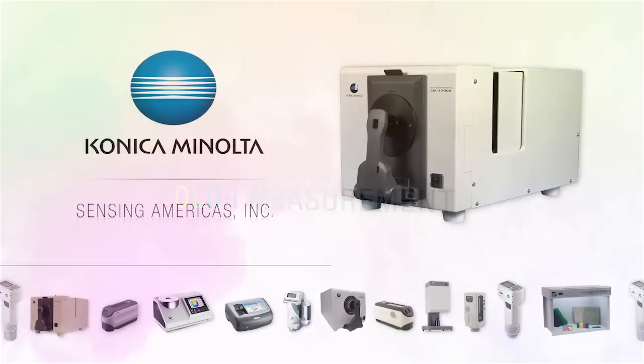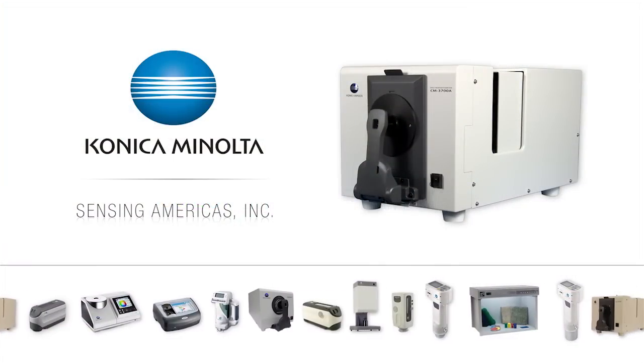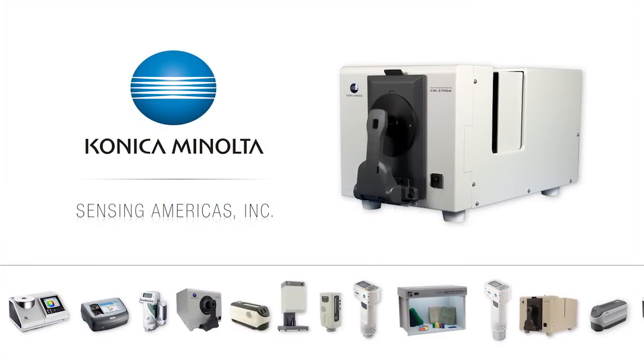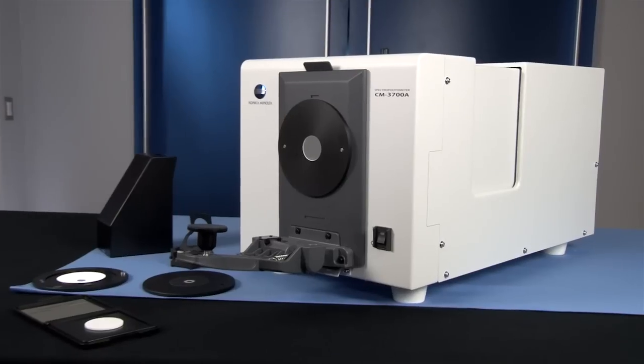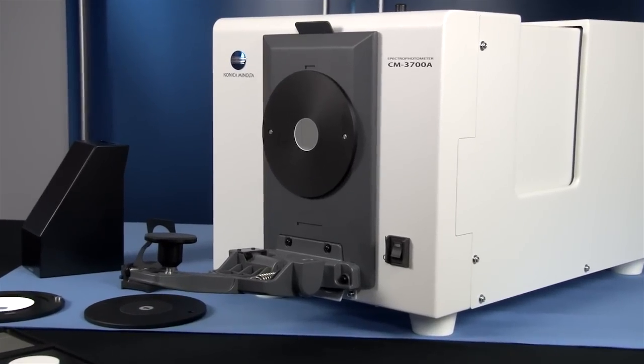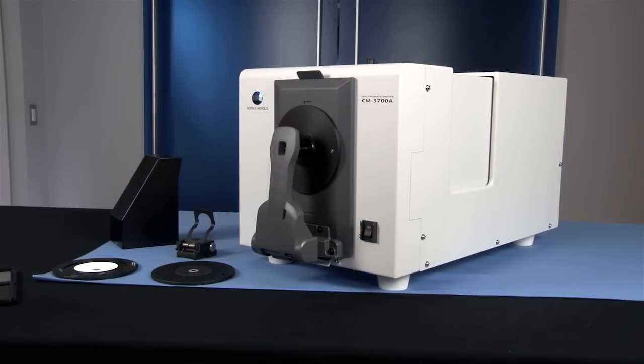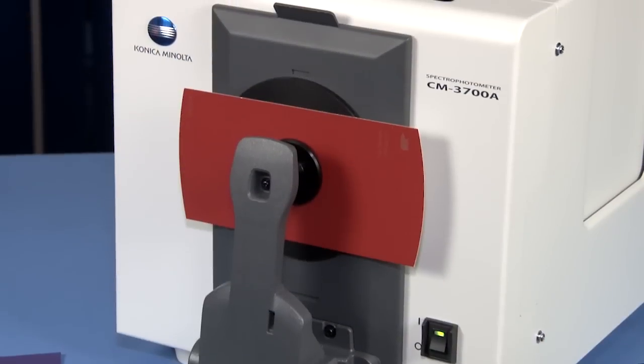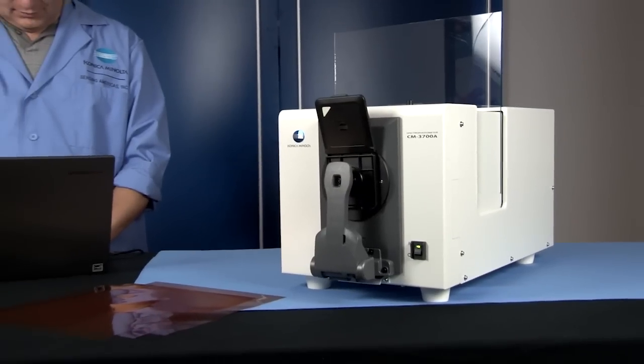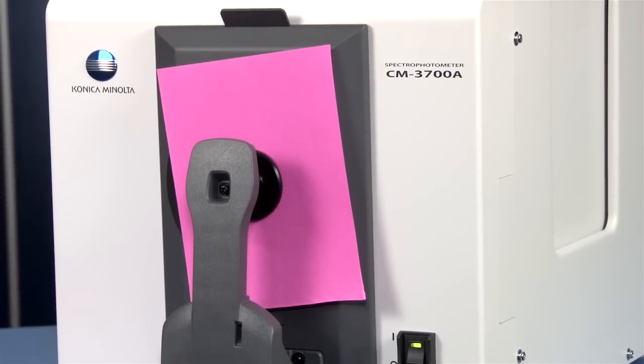For performance and reliability, Konica Minolta Sensing's CM3700A is a state-of-the-art benchtop spectrophotometer designed to evaluate the color and appearance of solid, translucent, transparent, and fluorescent samples small to large in size.